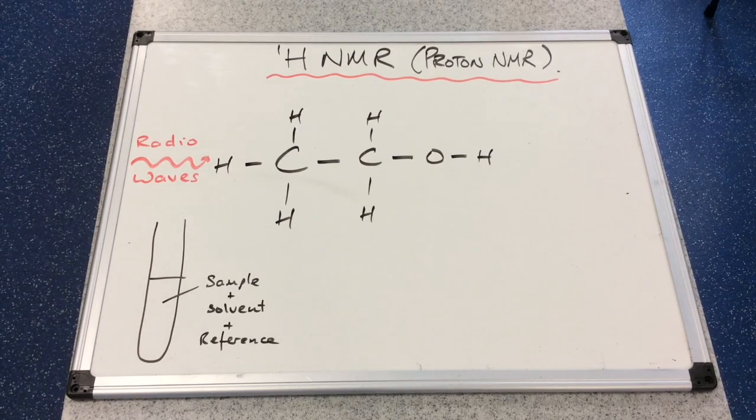In this first Proton NMR video, I'm going to look at the simplest type of Proton NMR spectra, and then in a subsequent video I'll take it a step further where we'll look at the extra detail that Proton NMR can give us. So we'll just start off with the basics. It works in exactly the same way as carbon-13 NMR.